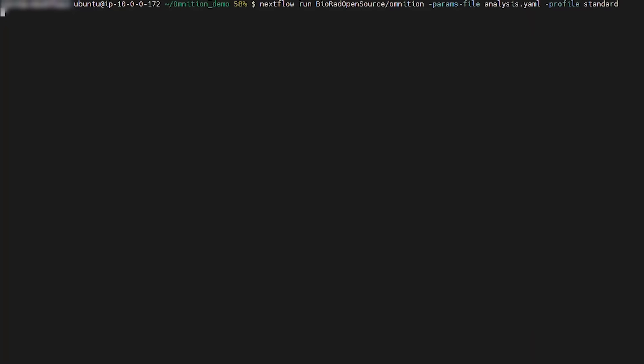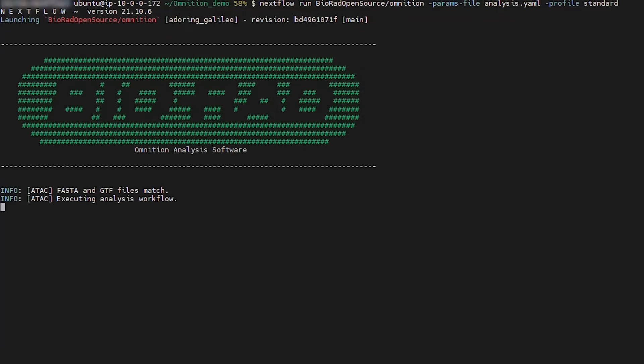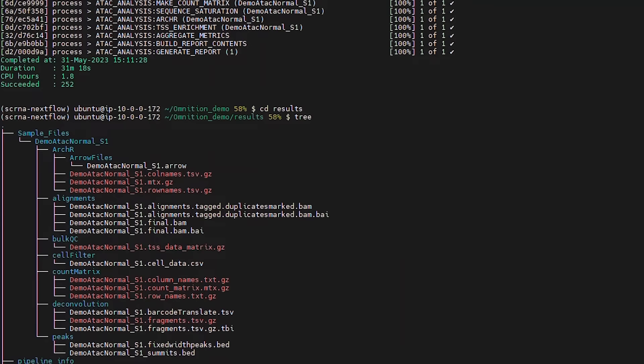To begin the Omnition analysis workflow, the script is very similar as the reference workflow. The key difference is that we specify the analysis.yaml file instead of the reference one. Once Omnition begins, you will see this output. Once complete, you will have a results folder containing the following different outputs.